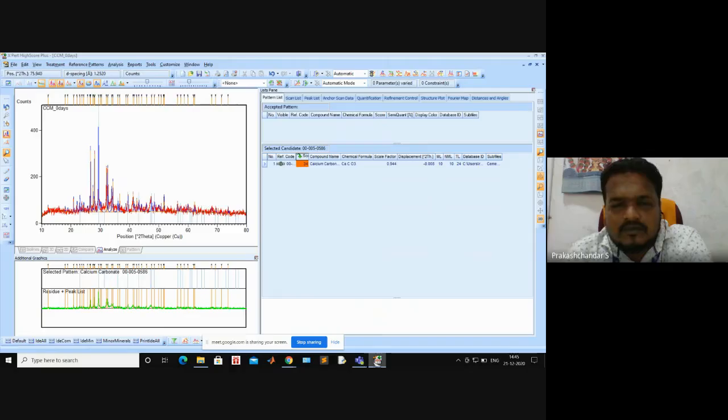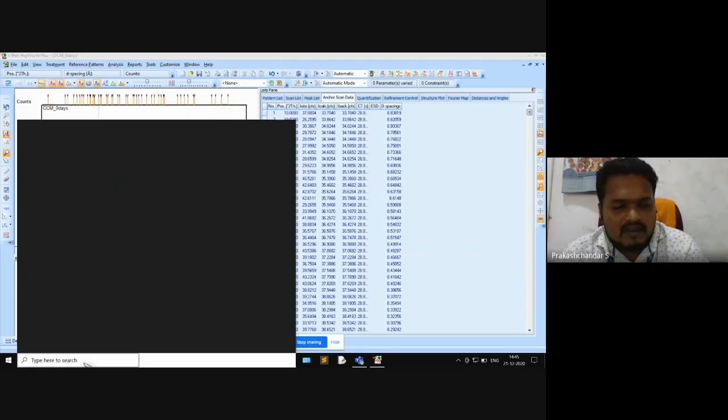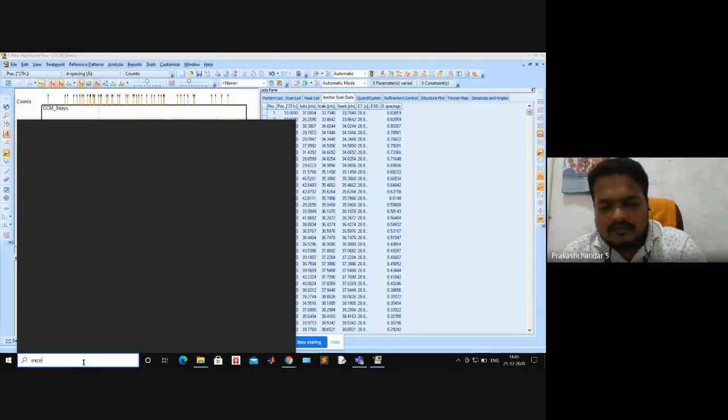Okay. So now go to the anchor scan data, right click the anchor scan data, and copy the list. You can make a copy. Open Excel.